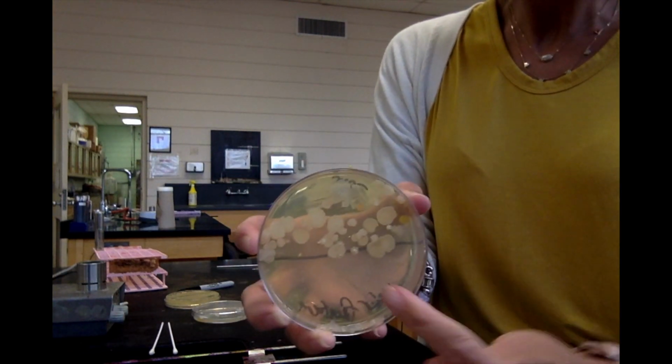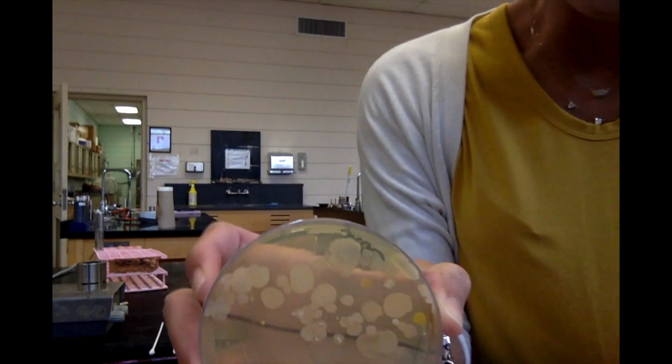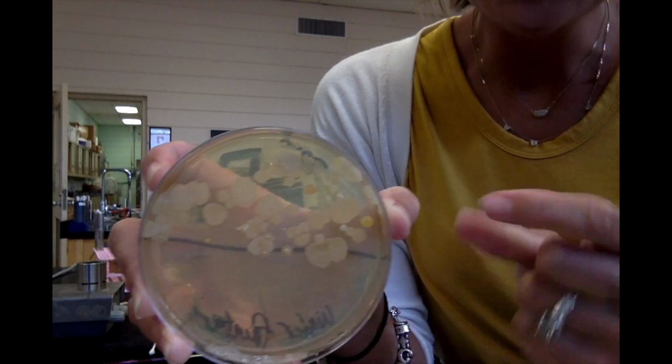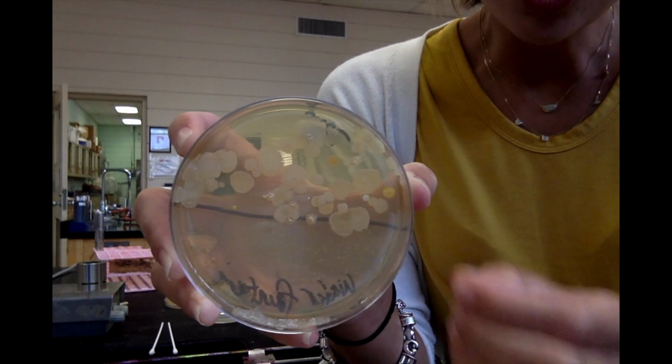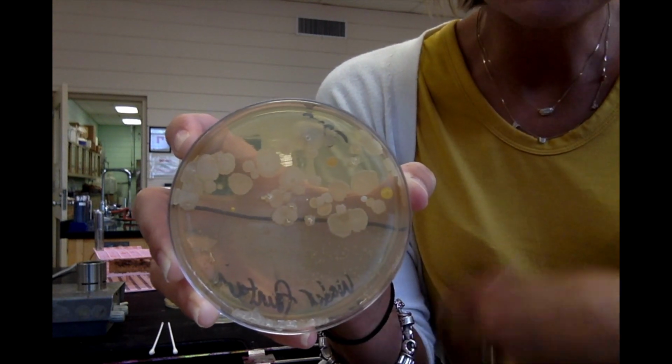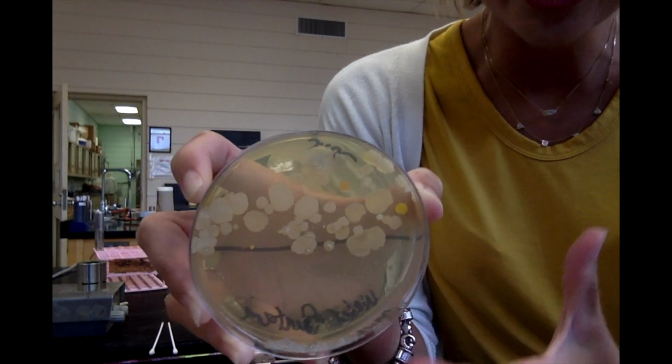So that's the bottom of my shoe. You can see there's lots of different kinds of bacteria. Each one of those is called a colony. That's where the bacterial cell landed on the plate, and then it has multiplied over and over again to give rise to the colony that you're actually seeing.